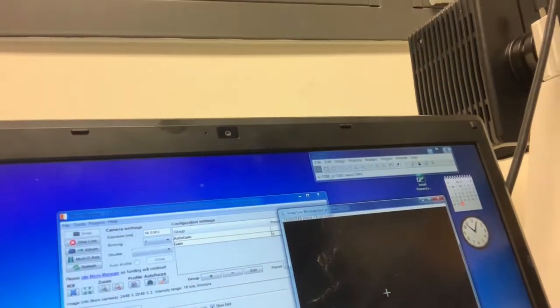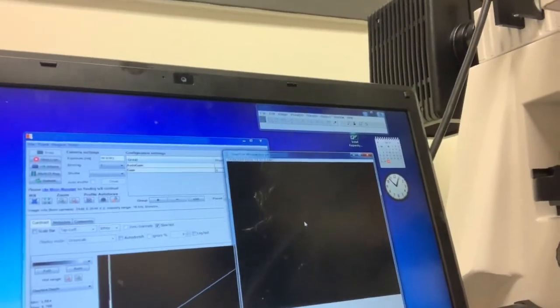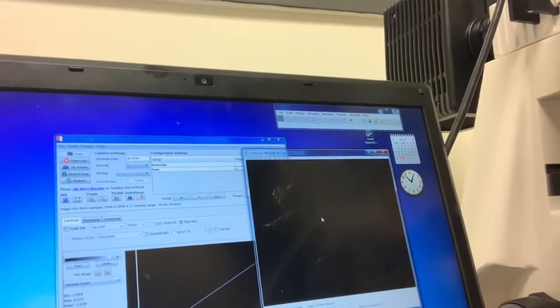And it says Live. Alright, and this little screen will pop up. And this is what's going to be sending to the camera. So for you to actually see stuff, you'll have to adjust the camera and obviously turn off the main light if you haven't already.